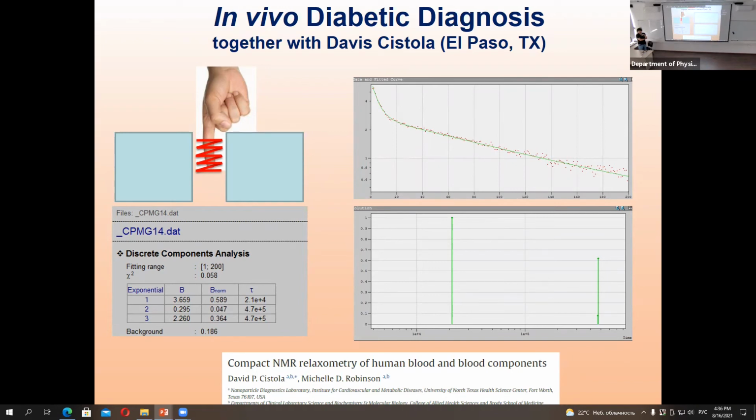On the other hand, it's possible if you build a high resolution NMR, then you can just look at the spectrum and find the glucose contribution in the spectrum. But you know, this will be very different money. And I'm not sure that now it's possible to build such a device that you can put your finger in without cutting. So the idea is great, but not yet. But what do you mean by high resolution NMR? Does it mean you need more signal? For high resolution, you need to have more homogeneity of a magnet. The homogeneity must be perfect. It must be far below 1 ppm.